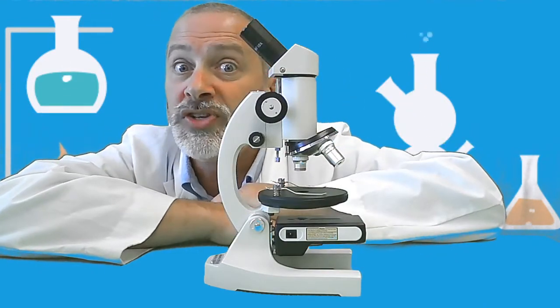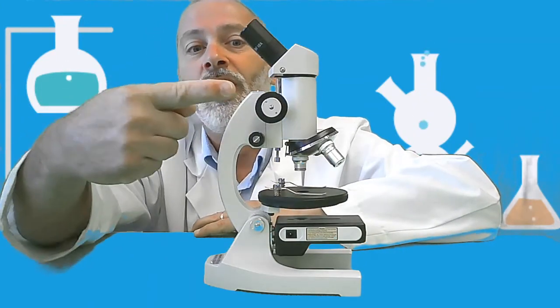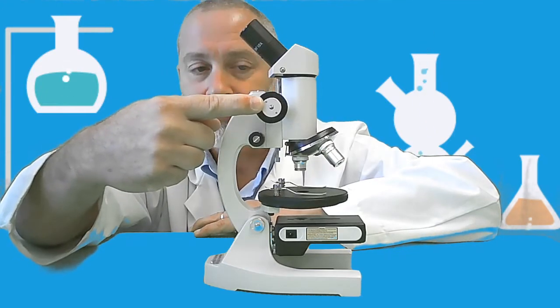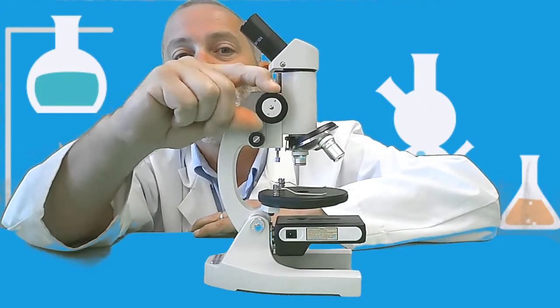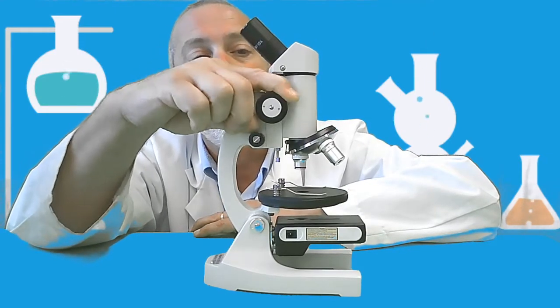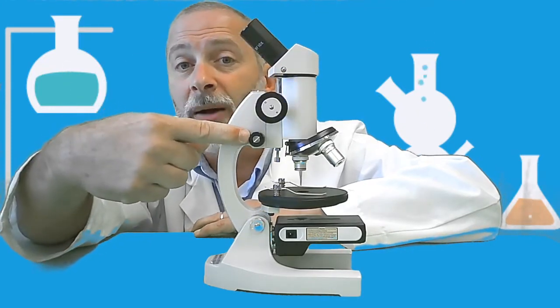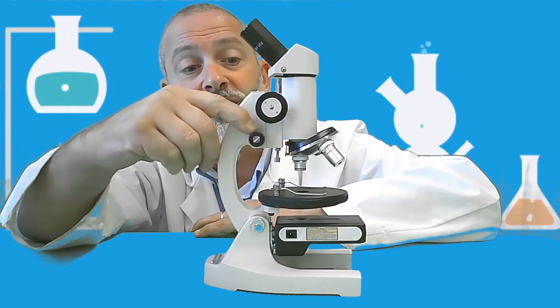All right, let me keep quizzing you here. I got a little sidetracked with all that little trivia info. The large adjustment knob here, call it out loud and proud if you know what it is. It's the coarse adjustment knob. Now watch what happens. When you turn the coarse adjustment knob, the whole body tube goes up and down. Now, what is the small knob called? Good, it's the fine adjustment knob.